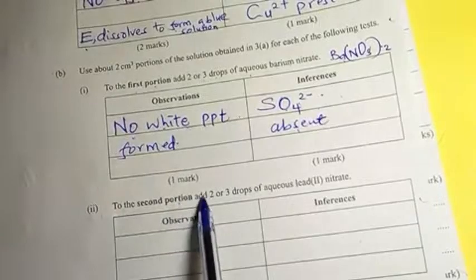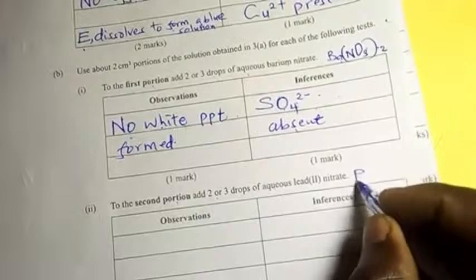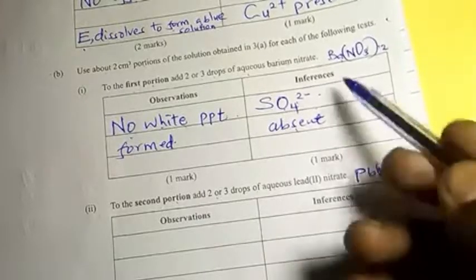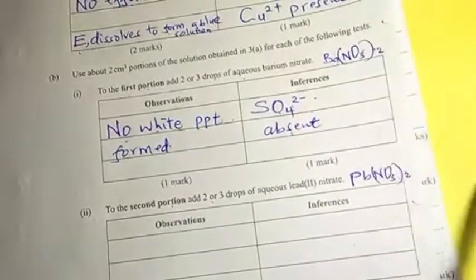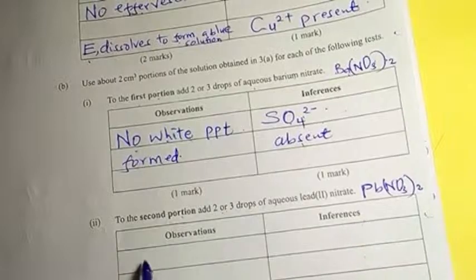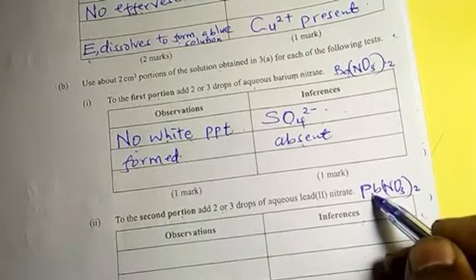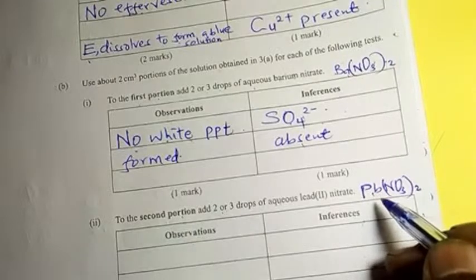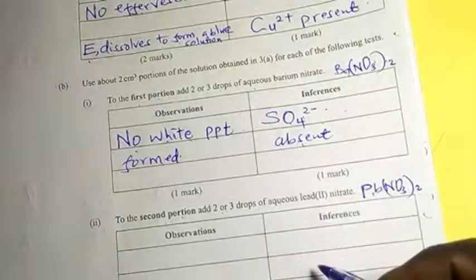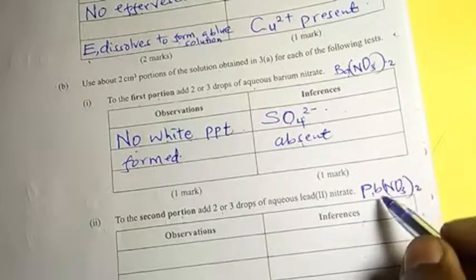To the second portion, add 2 or 3 drops of aqueous lead nitrate. We are adding lead nitrate. Now remember, from here we have said there is no carbonate, so let us see the observation here. When you are adding lead, remember, you expect a white precipitate or a yellow precipitate. Like I said on the other video, if there was iodine inside there, it will form lead iodide, which is a yellow precipitate. If there is a chloride inside there, it will form lead chloride.